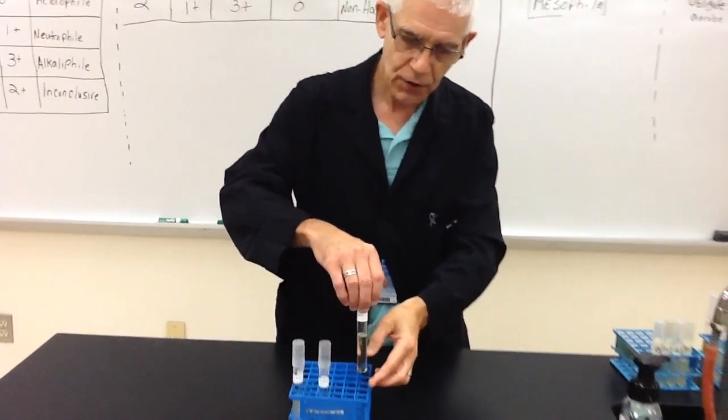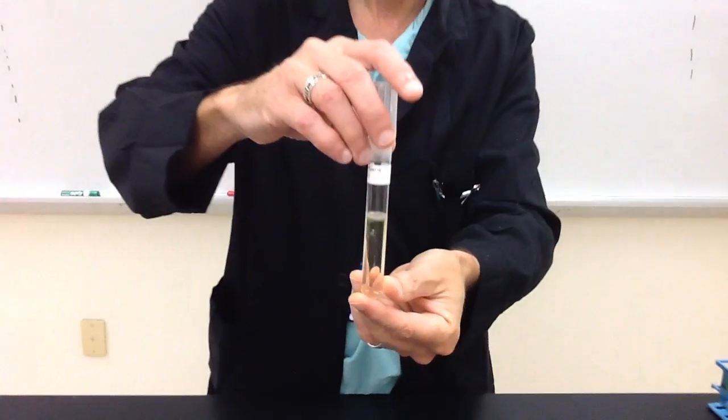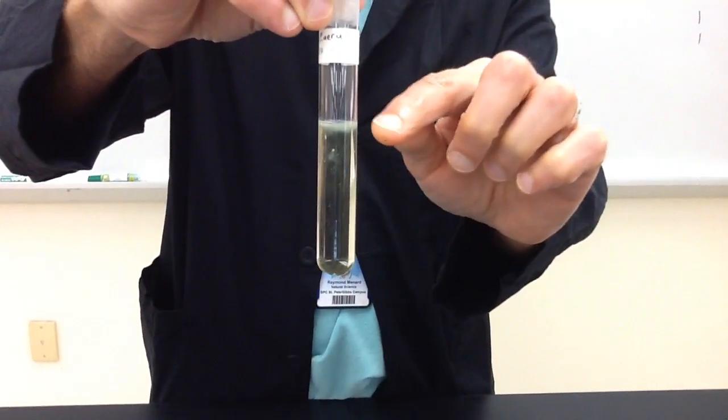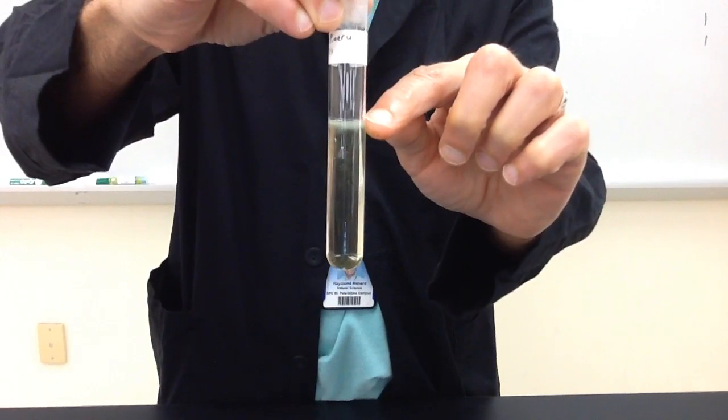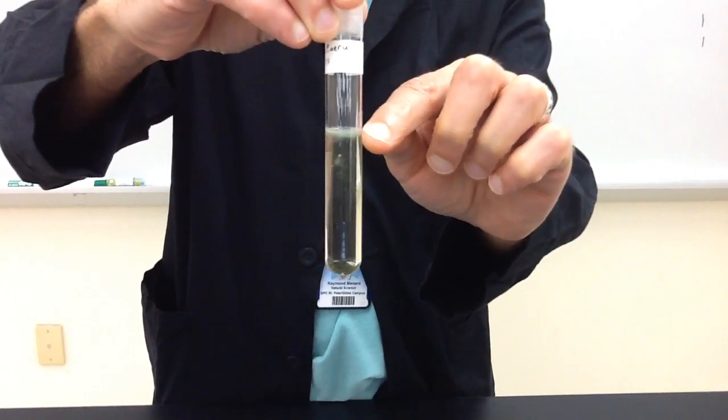So, this is a good example of an obligate aerobe. If you take a look, it grows right at the top here, beautiful. This is Pseudomonas aeruginosa.